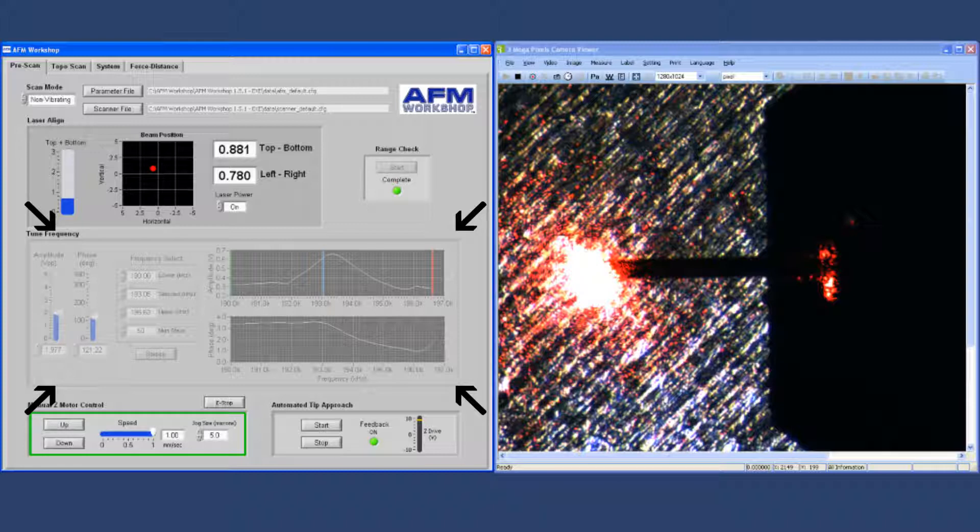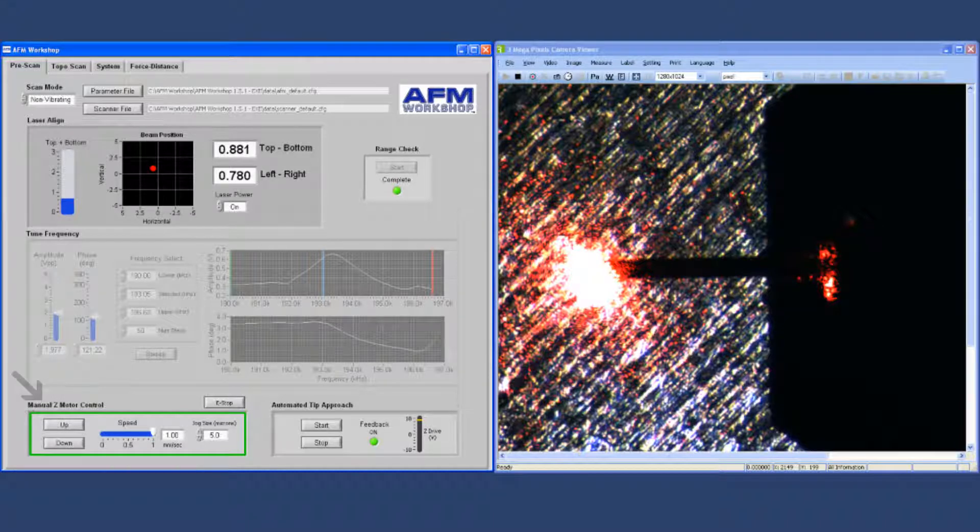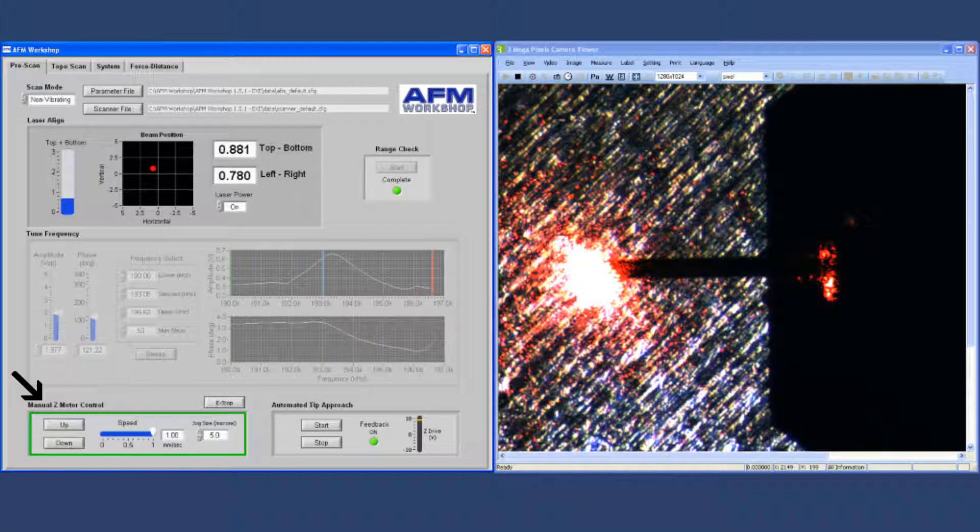Finally, we have the manual Z motor control, which allows you to move the motor up and down in the stage, and the automated tip approach, which you start here.